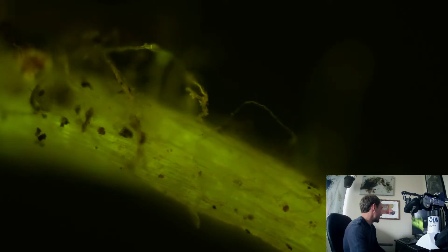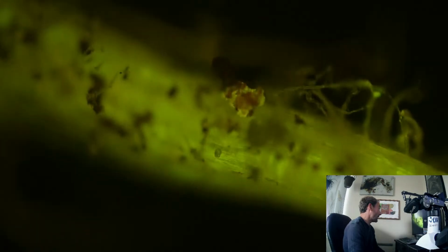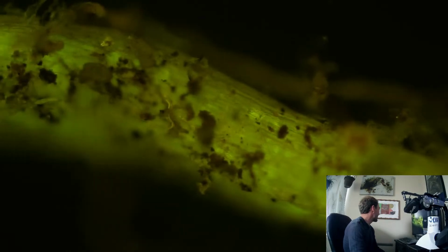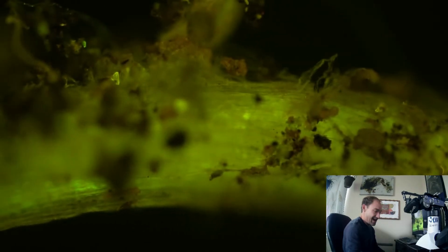That's all spectroscopy, and different lights and different wavelengths can then be correlated to different species and different minerals. But you just imagine the amount of work that will take. Different environments, different lighting, different this and that.